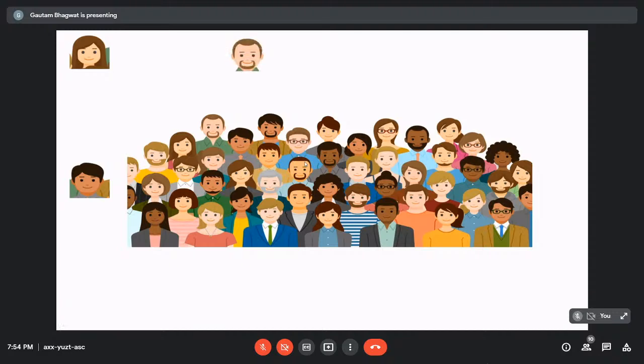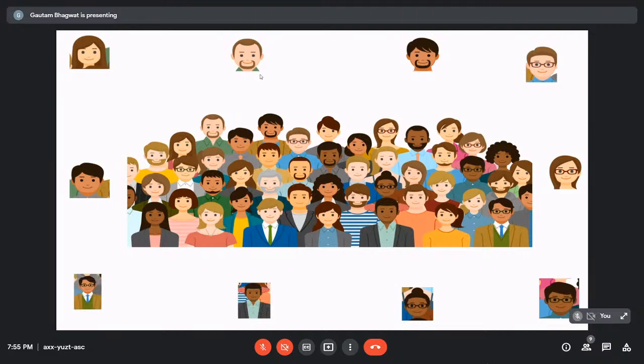I can add one more: presence of a beard, if I want to sort amongst the boys. So I add a parameter of beard, but this might not suffice, because I can very well see that there are so many different kinds of people in this entire population, or if I say there are so many different kinds of cells in this, that only differentiating it into two or three cells is not sufficient for me. So what I do is, I add one more parameter, maybe a color of the skin. I add one more parameter, maybe presence of spectacles or not, and so on and so forth. And then by adding more and more parameters, I can actually sort each and every person or cell in this sample.